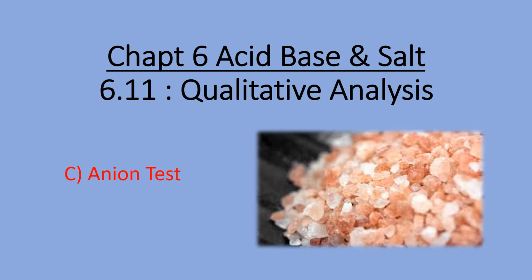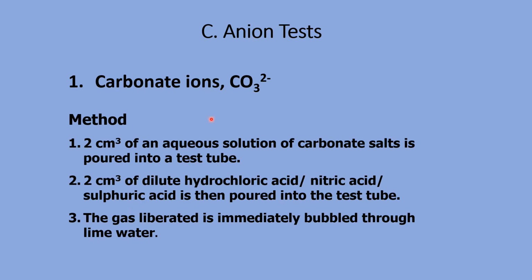Chapter 6, Qualitative Analysis. C. Anion Tests. Please turn to page 14 in your handout. Anion Tests. Carbonate ions. Number 1.